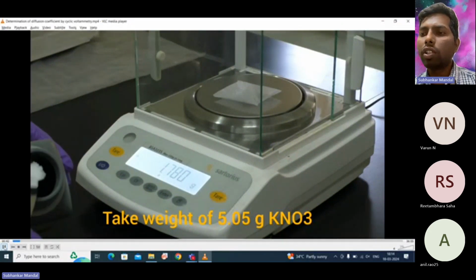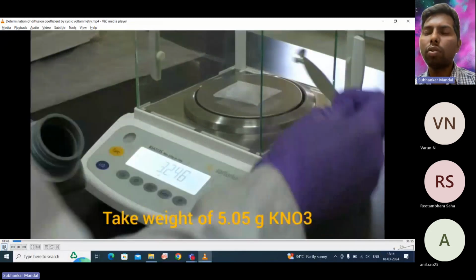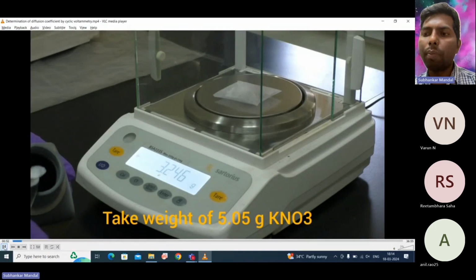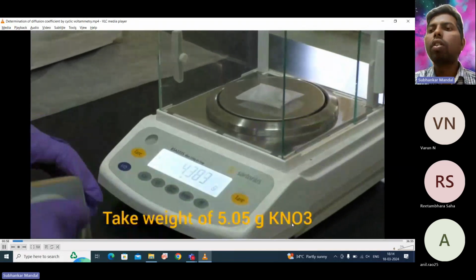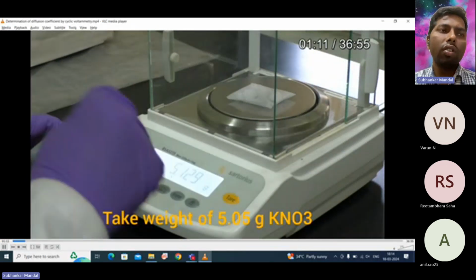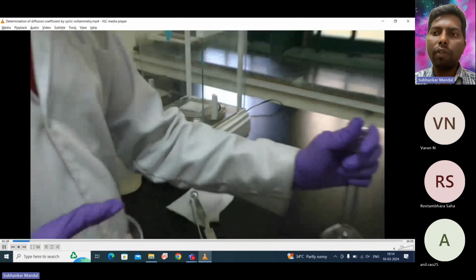Here we need 0.2 molar KNO3 solution in 250 ml of distilled water. For that we need 5.05 grams of potassium nitrate, and we are measuring that. Yes, it is 5.055 grams.